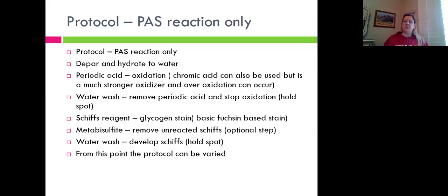Then you're going to go into Schiff's reagent. This is your glycogen stain, your fungus stain, your polysaccharide stain, your basement membrane stain. Schiff's reagent is basic fuchsin based. Now remember that Schiff's reagent is held in the refrigerator.